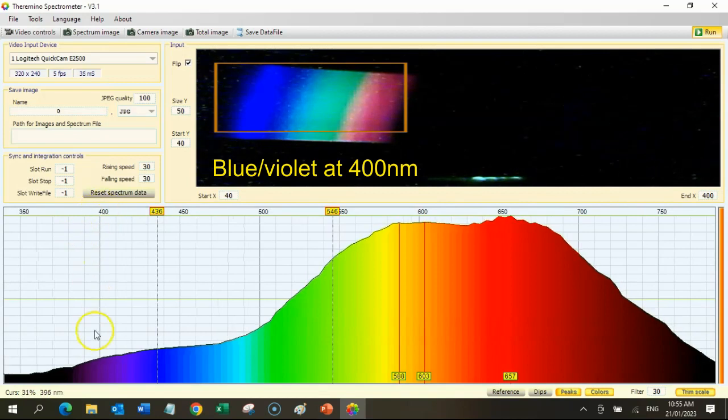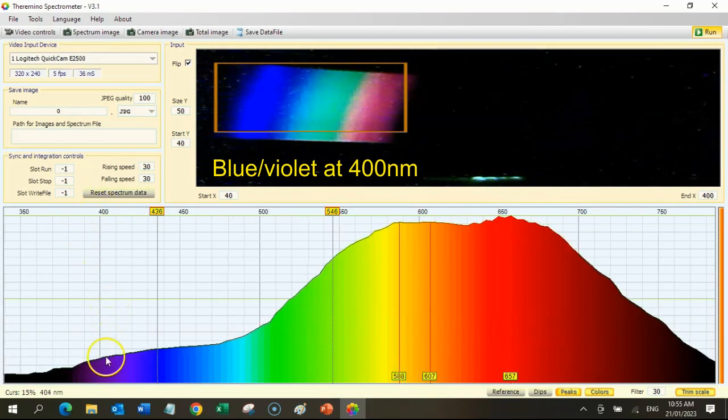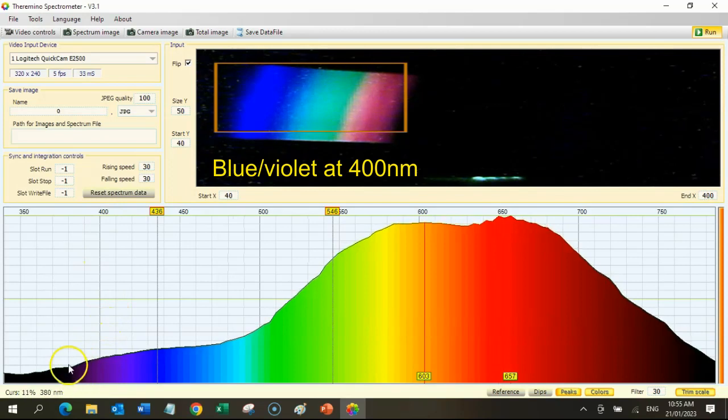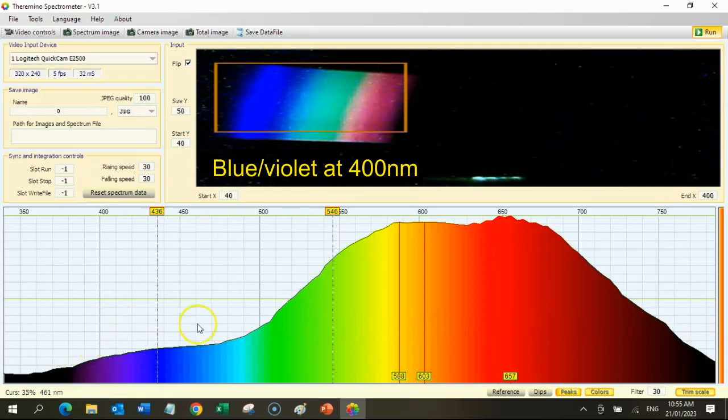And then the blue-violet lines up with around about the 400 nanometer mark.